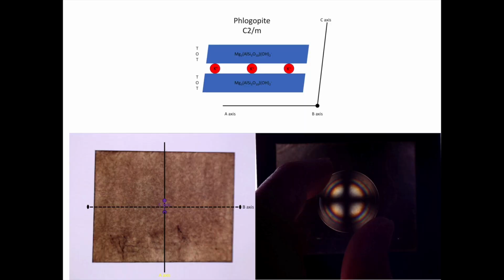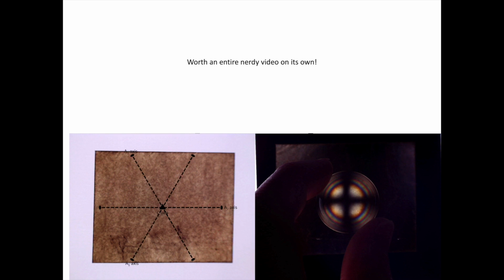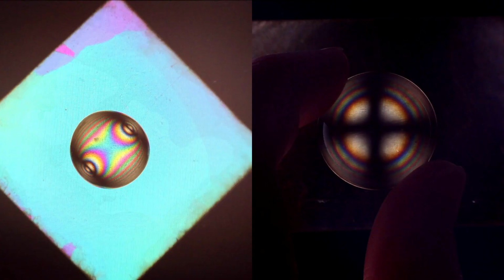It's always a good idea to understand the limitations of the techniques you're applying. Even though we're not sure if our phlogopite is truly biaxial with a very small 2V angle, or uniaxial and the trigonal polytype of phlogopite, we can still use our optical properties to differentiate our phlogopite and muscovite fairly easily. Unless we end up with muscovite that is also the trigonal polytype.